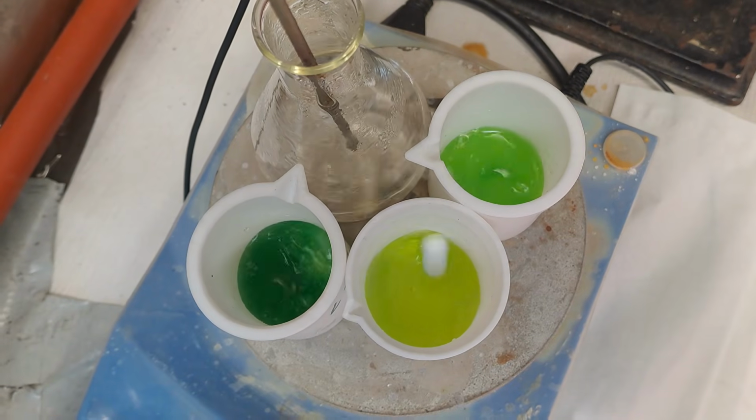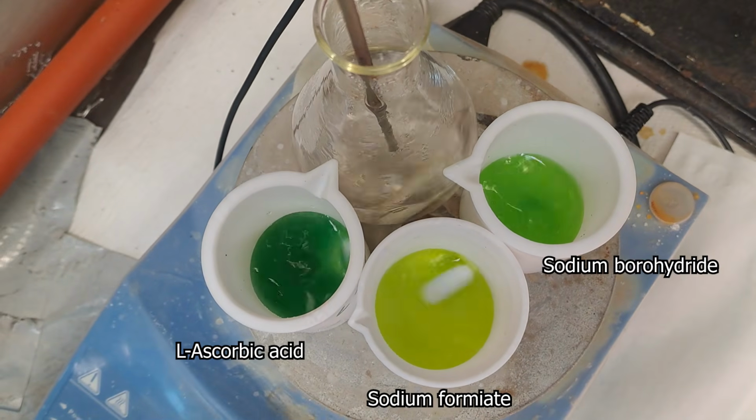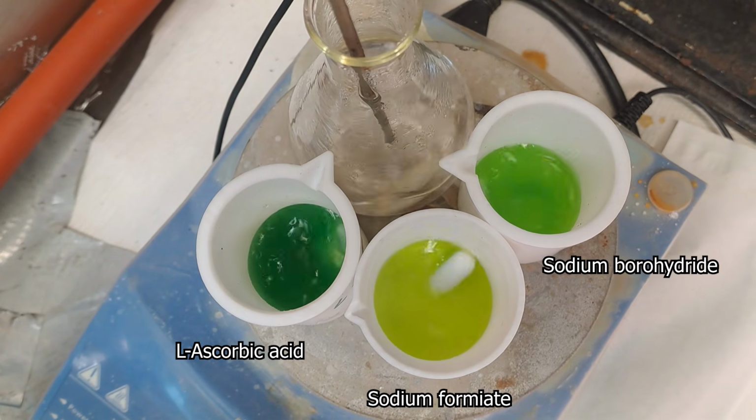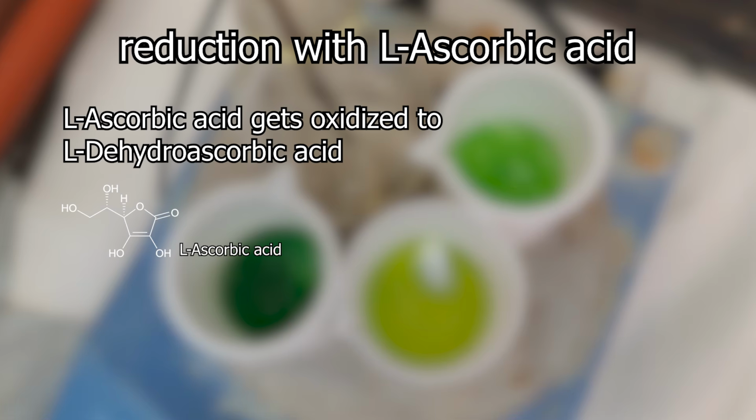After a reaction time of 15 minutes, the whole thing looks something like this. So, how do I best explain that now? Let's start with the L-ascorbic acid. So, the reaction with the L-ascorbic acid shows the desired color change. So there's no need to worry about that.